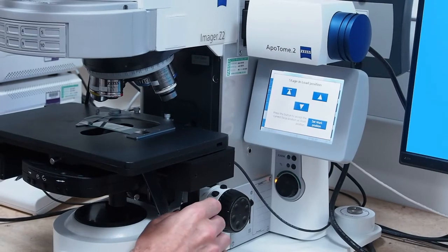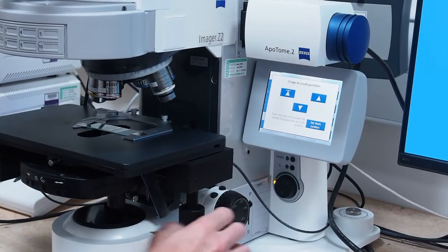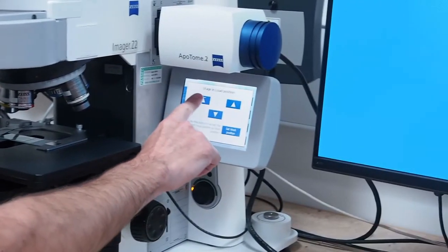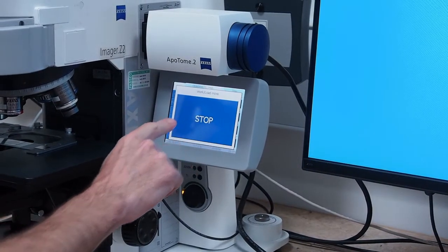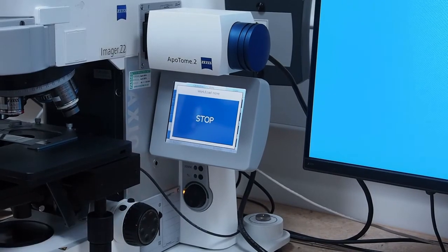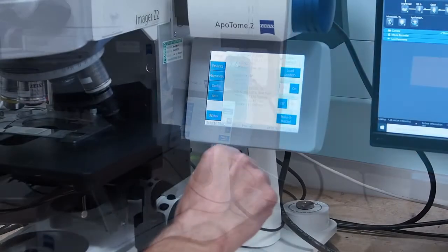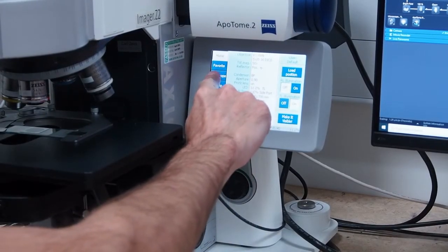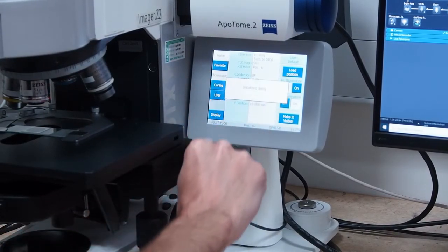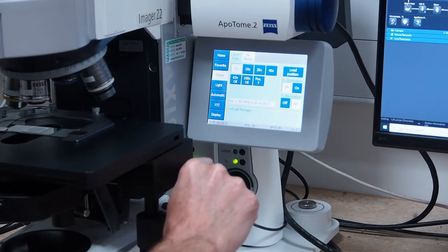Return to the approximate focal plane using the left hand up arrow on the touchscreen. Click the microscope tab icon and select the 10x objective.